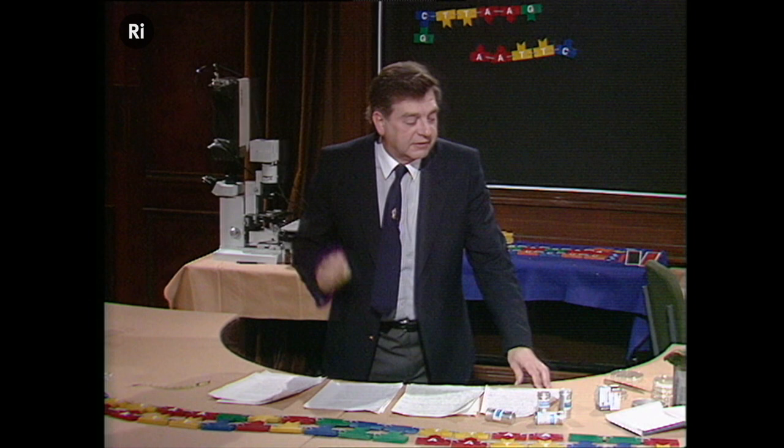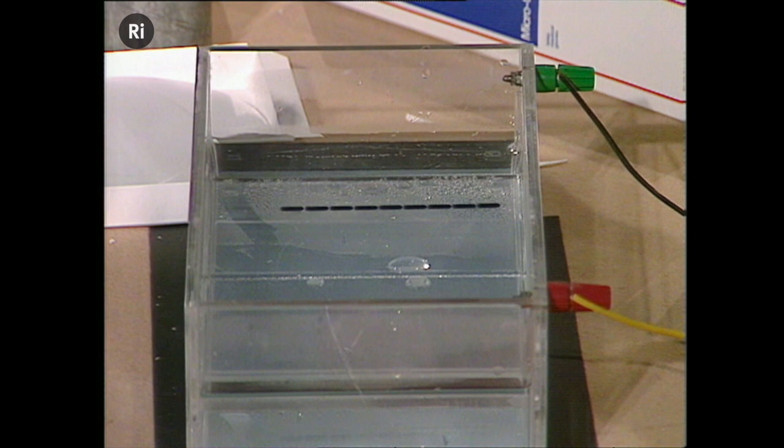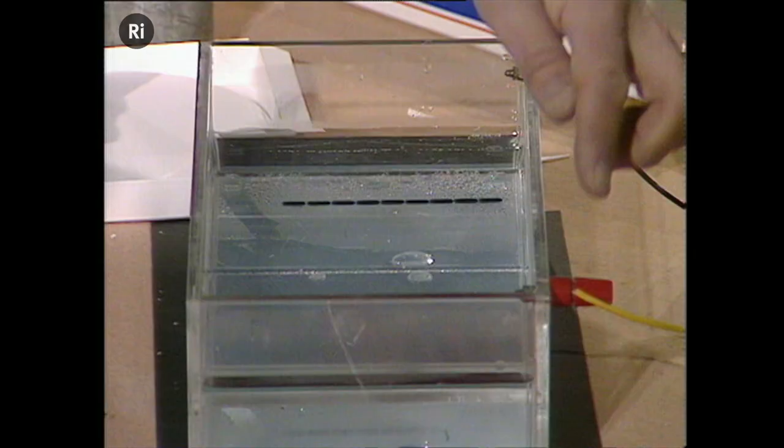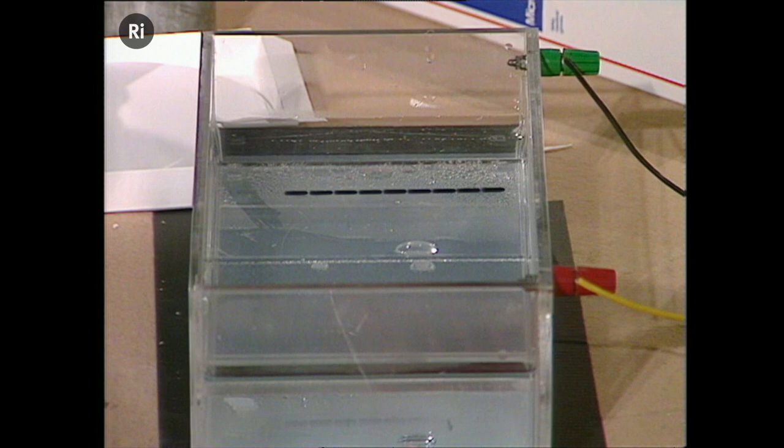You see in this box, we've got a gelatinous surface. You can see it, the grey material, on a glass plate. And it's bathed in a liquid. And we've got a negative and a positive charge here going through, so that electricity is running through that liquid. So if we put things at one end, they're subject to an electric current.